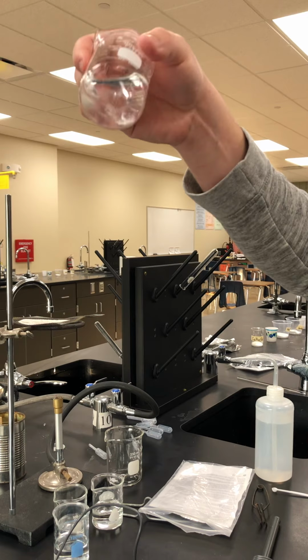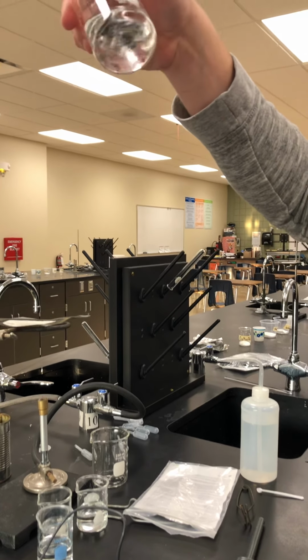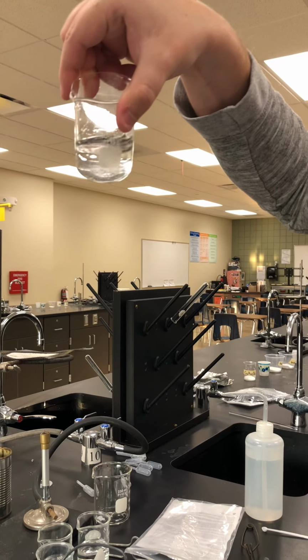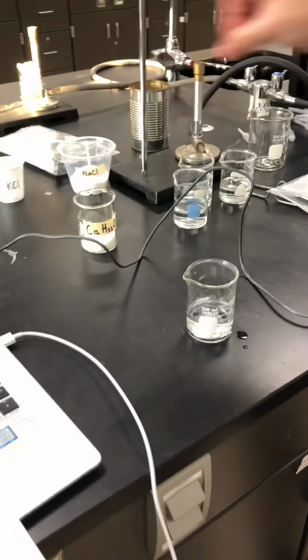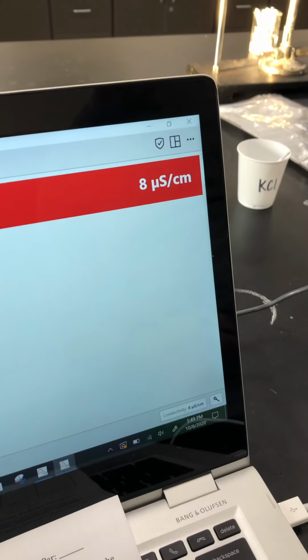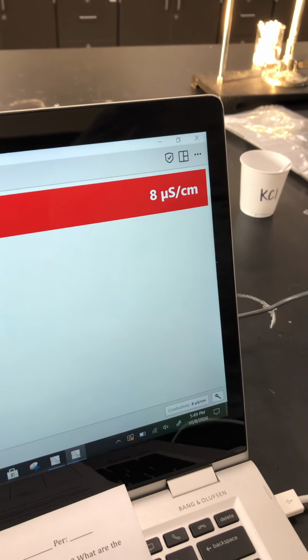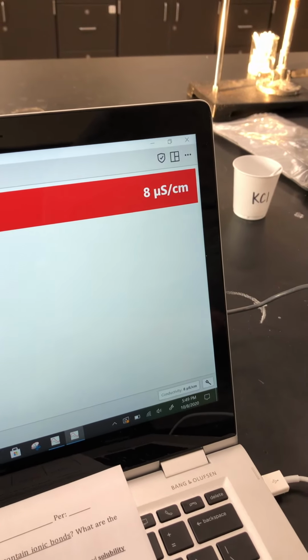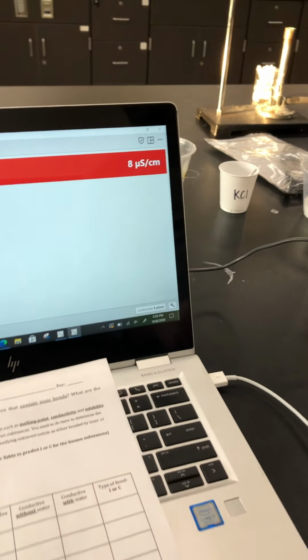So I would say again, most of it has dissolved. There's a little bit at the bottom, but definitely not 4 scoops worth. So it did dissolve. And now let's test the conductivity. So we see that it went up to about 7 or 8. It didn't go past 1,000, so we're going to say that this one does not conduct electricity with water.